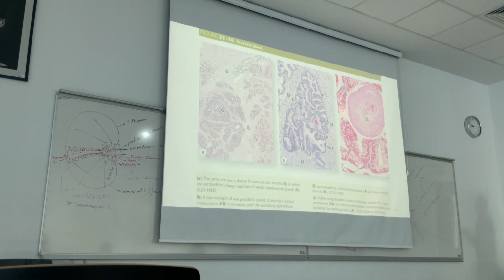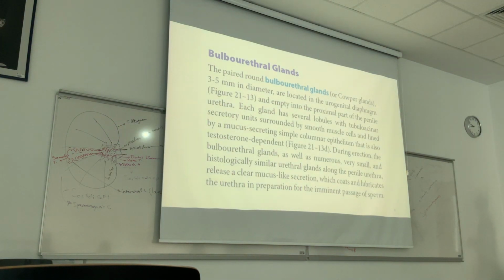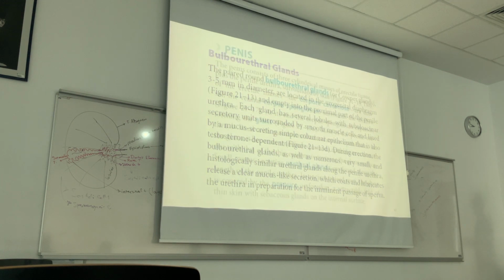Because of that, maybe you can see a similar shape with the ductus deferens and ductus efferentes. And also, you can confuse this part with the vesicula seminalis. But the main thing in separation is corpora amylacea, and the epithelium of the prostate is composed of simple columnar and pseudostratified epithelium. In bulbourethral glands, as you know, we have only mucous secreting cells.